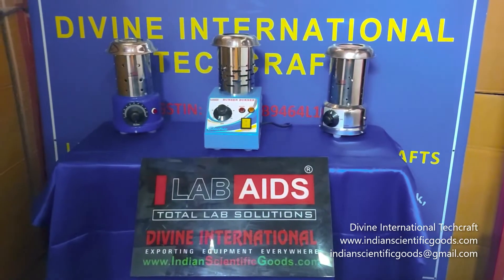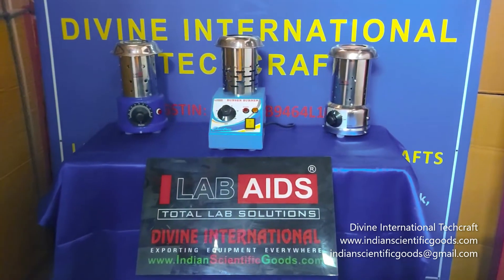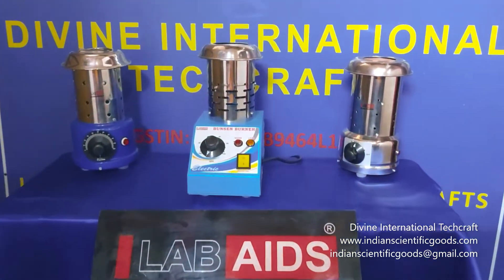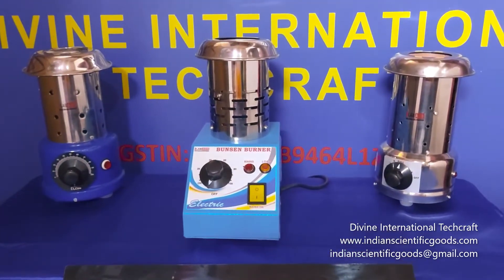Hello, welcome to the official product introduction channel of Divine International Techcraft, New Delhi, India. In line with our previously introduced electric Bunsen burners, we introduce yet another model and design of the same.